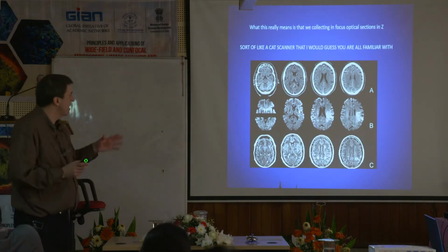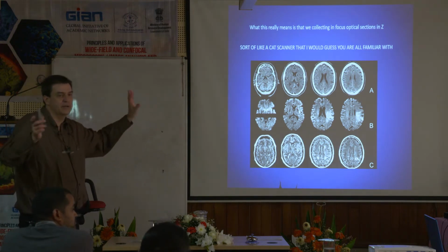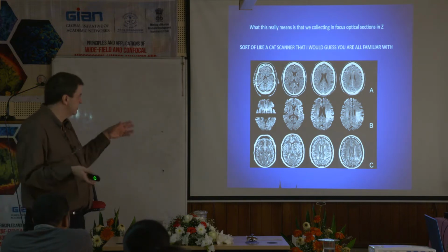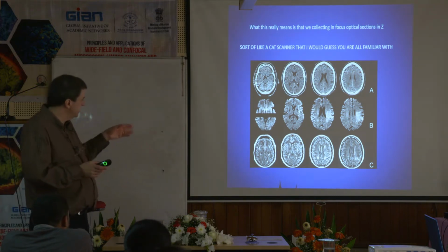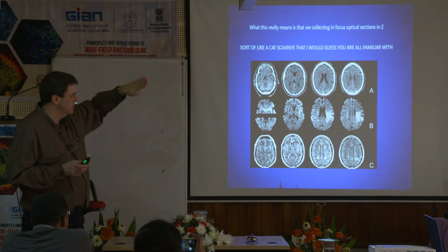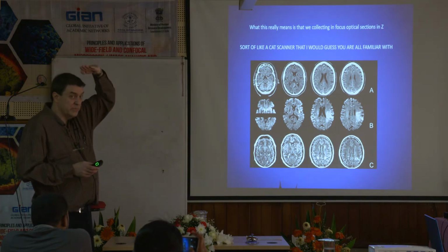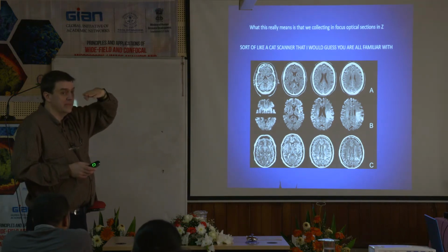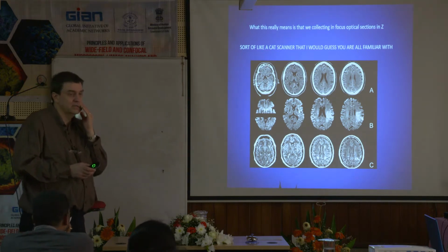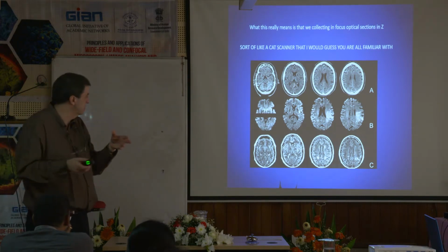Optical sectioning. Now, this here is a CAT scan, okay? And I don't know how many of you have been hurt or injured or have had different things done. My daughter had a seizure a few months ago, so they did a CAT scan of her brain. What a CAT scan of the brain basically is, they do a section, like an X-ray, an X-ray, an X-ray, and they build those up, and they're able to get a three-dimensional reconstruction of her brain, okay? So you've all heard of CAT scans before, or CT scans, I guess they call them too.